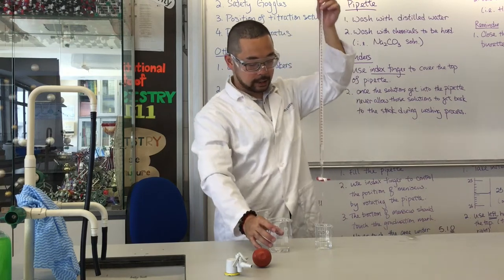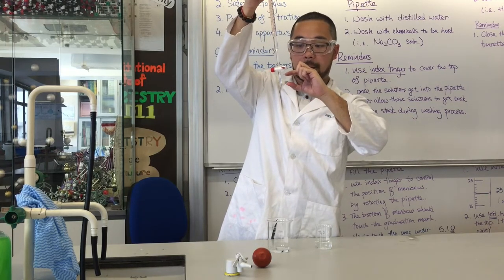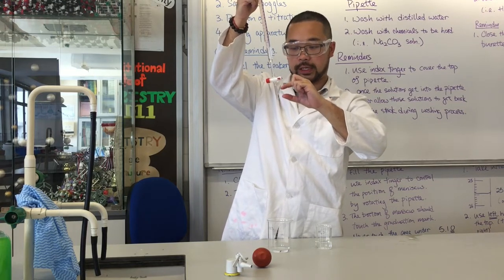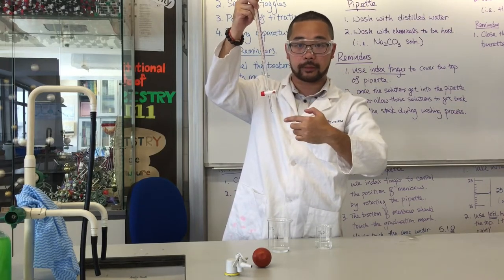After you fill the burette, in the lower part, the jet, you may see some bubbles or one big bubble. If you keep these bubbles, it may affect your titration process. So remember, after you fill the burette, make sure to flush the bubbles out from the jet.